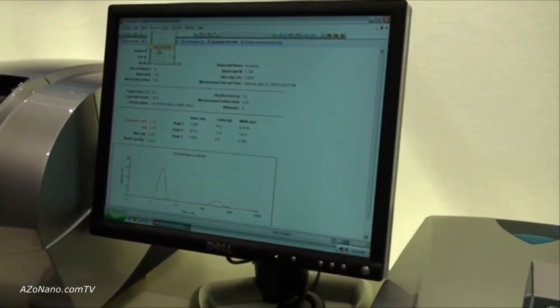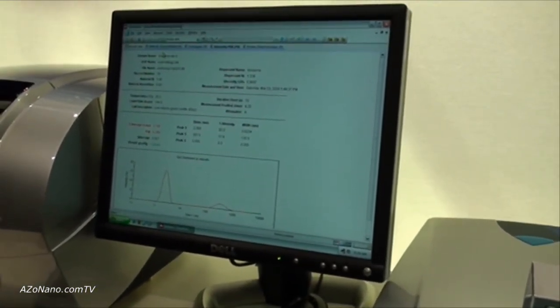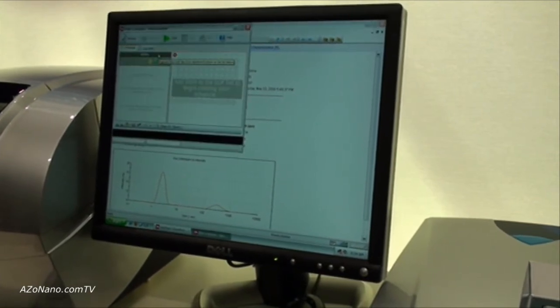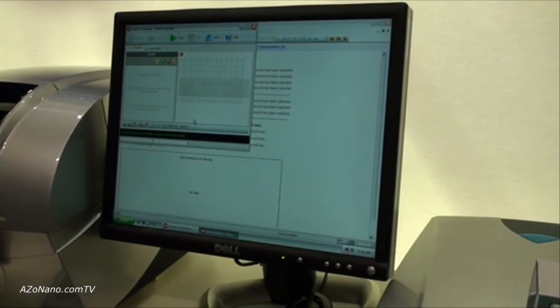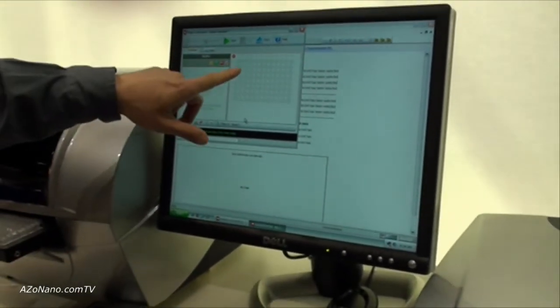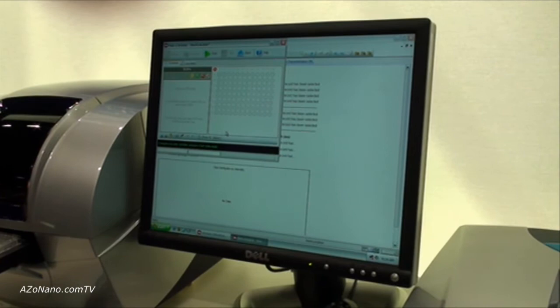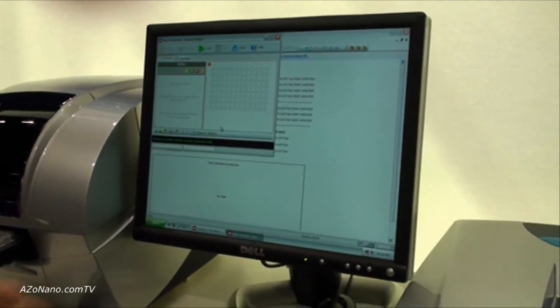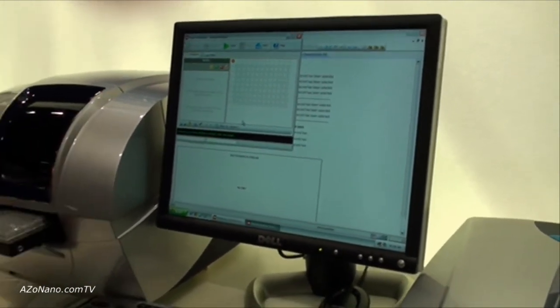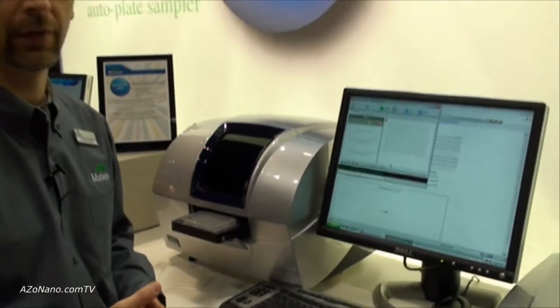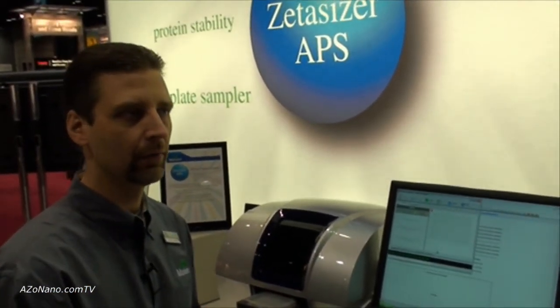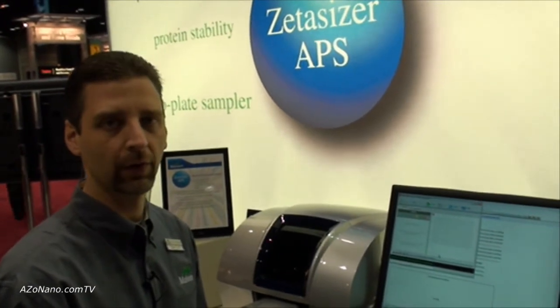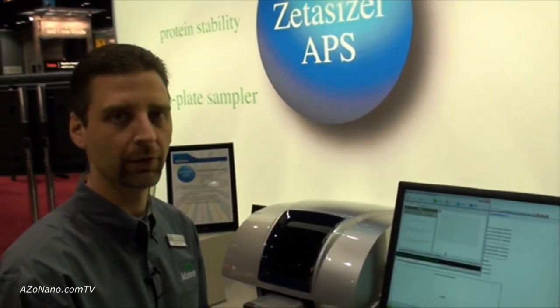To view results from a plate or set up your measurements, it's simply menu-driven and graphically oriented. You define the measurement parameters and assign those to wells. You can have a different measurement standard operating procedure for each well. Any range of wells on the plate or the entire plate is completely flexible and up to the user to define.